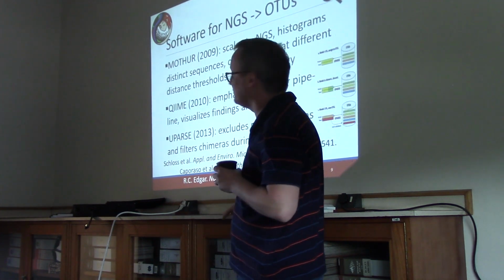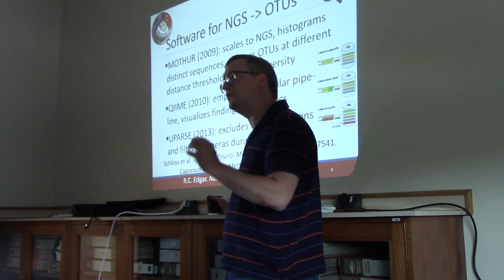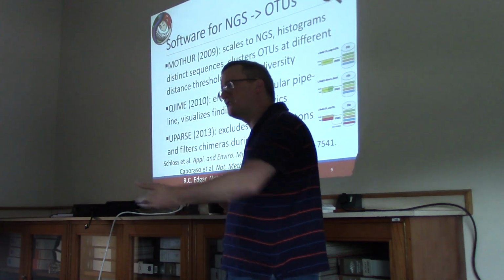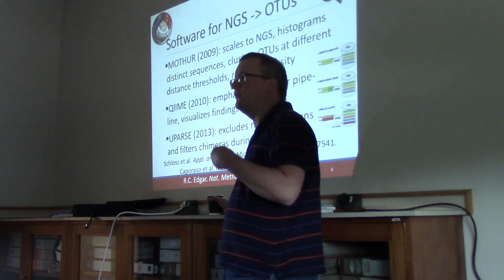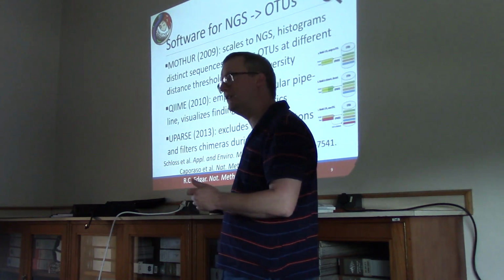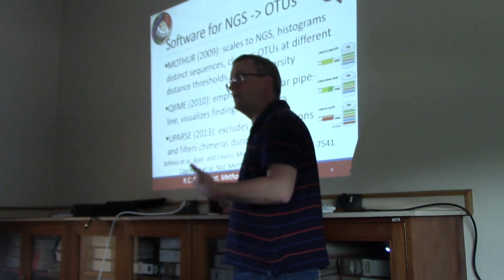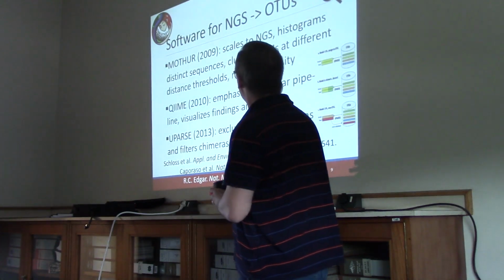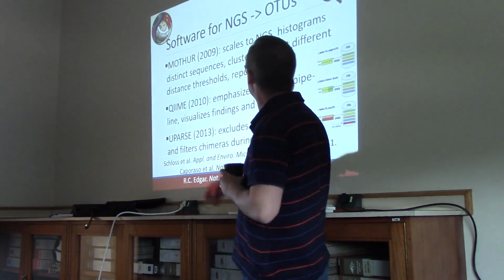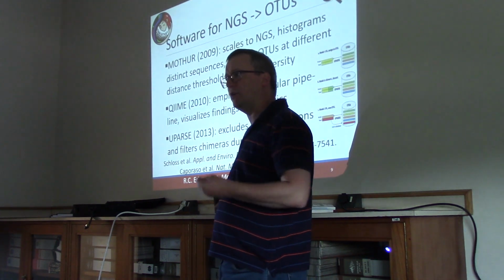Paper. One of the things that they were really focused on doing is making sure that people could use next-gen sequencers, massively parallel sequencers, for the purpose of microbiome research. Obviously, if you limit yourself to only being able to do 384 templates in a run, that's going to hold you back from getting a lot of depth in sequencing. So they wanted to create software that was scalable up to millions of reads. They succeeded.